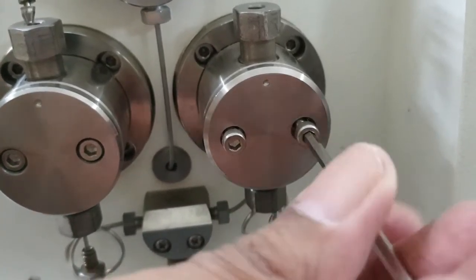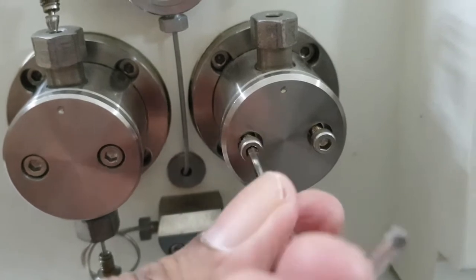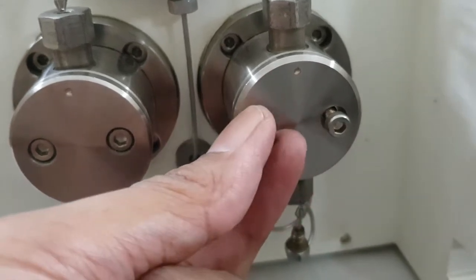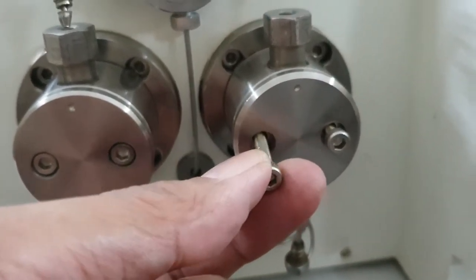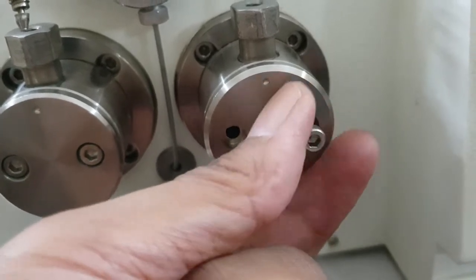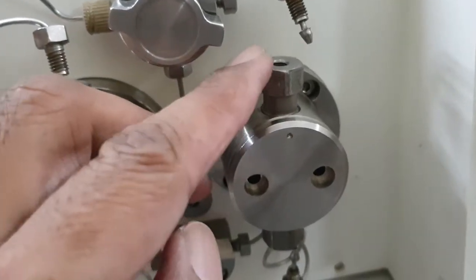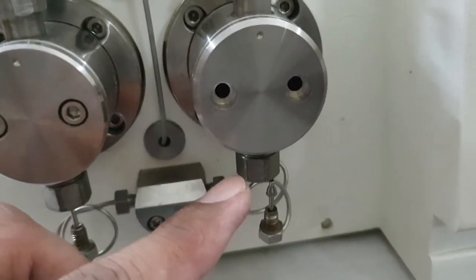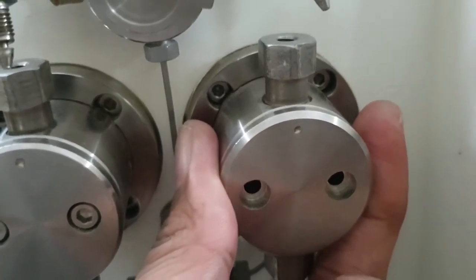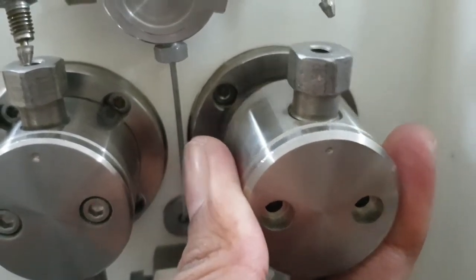Alternate between each side — one side then the other — otherwise there is a chance of breaking the plunger, which is usually made of quartz. Now the second screw is done. We have removed the nut from the outlet and inlet check valve, so this is now free. We can remove it slowly from the head, keeping it straight.